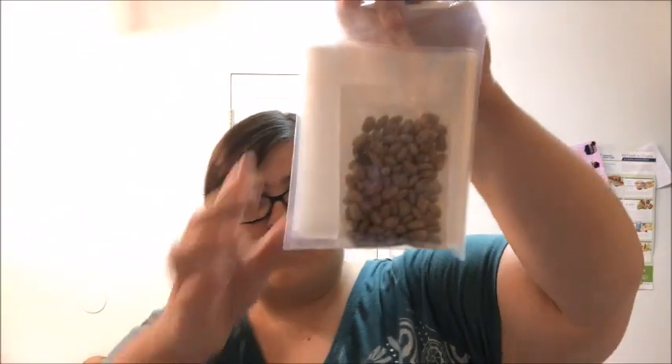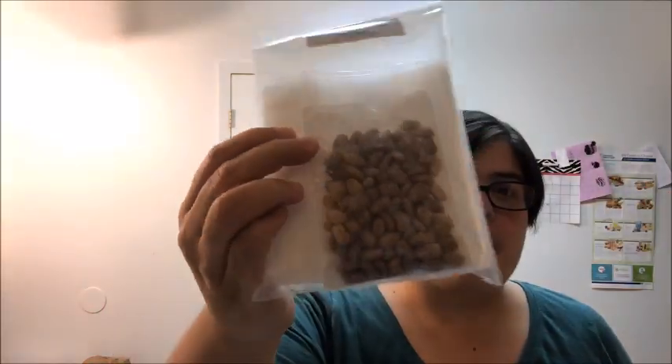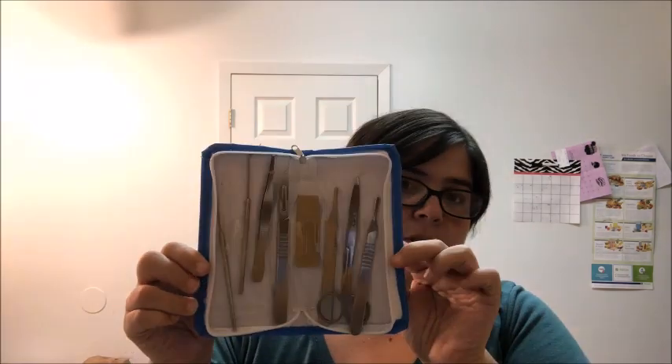This bag is labeled 'Intro to Science' and it includes five-by-eight bags and pinto beans. Then we have this nice little zipper pouch, and this is your dissection tools.